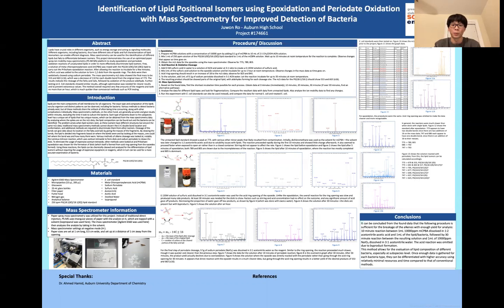And some experimental errors that may have happened include, first of all, how pure each of these reagents and the lipid and E. coli standards were. As you can see, there are some background values that appear up here, and even for here, I do not know what these peaks are. So that is one thing that we have to keep in mind when analyzing these data.